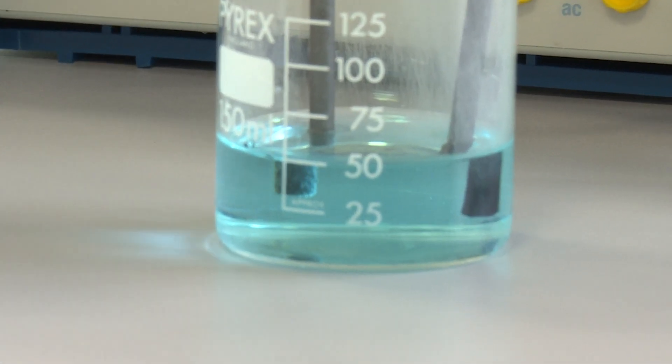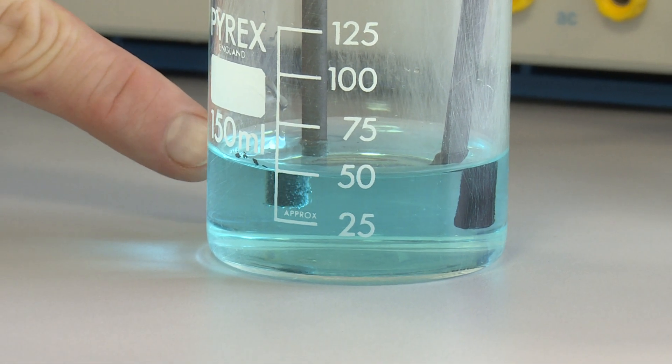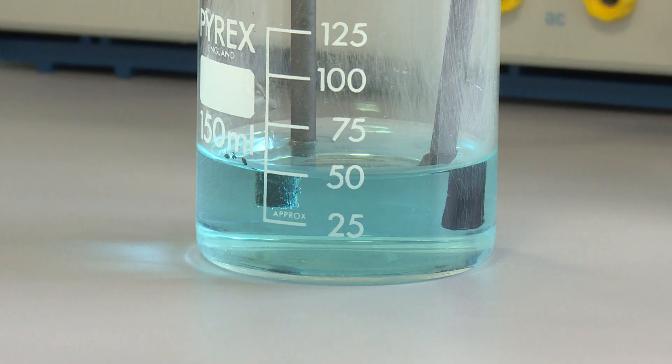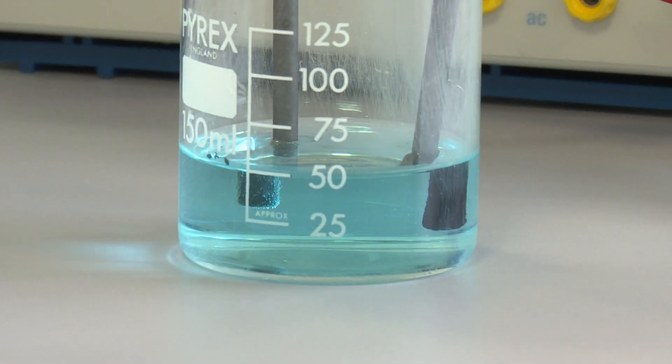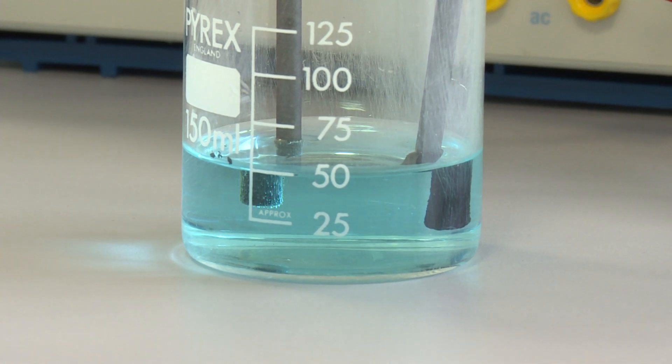You can see straight away here at the positive electrode we have a gas formed — you can see the bubbles of gas forming there at the positive electrode. And at the negative electrode you can see that a solid is starting to form on that electrode, on the negative electrode.